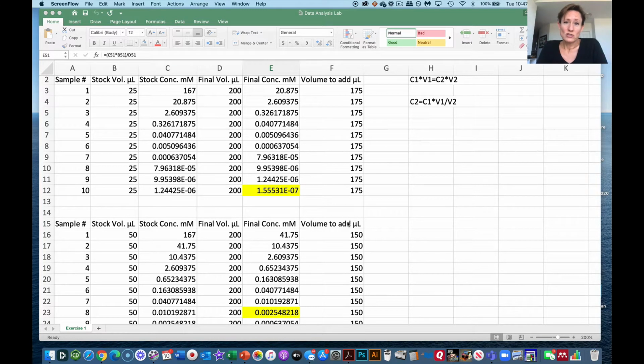So the second exercise that we're going to do in Excel is learning how to create a standard curve. So we need to make a new worksheet here. So to highlight, Excel creates workbooks, and within the workbook are individual worksheets. So this is kind of a way of having all of the information that you might need for a project, let's say within an entire workbook, but then there's individual worksheets for each thing that you're doing. The same is going to be true here.